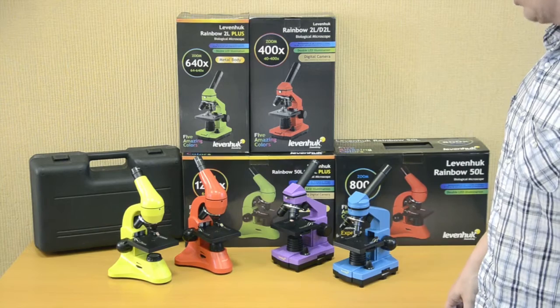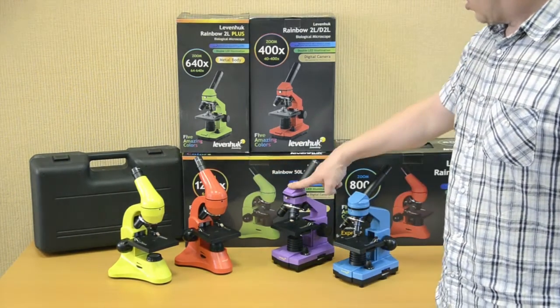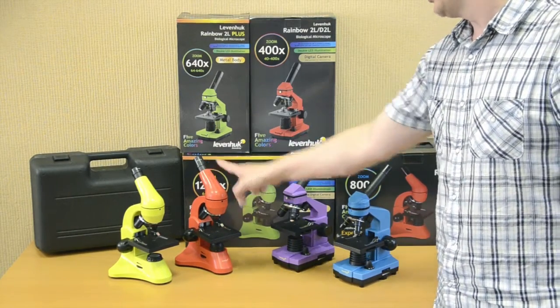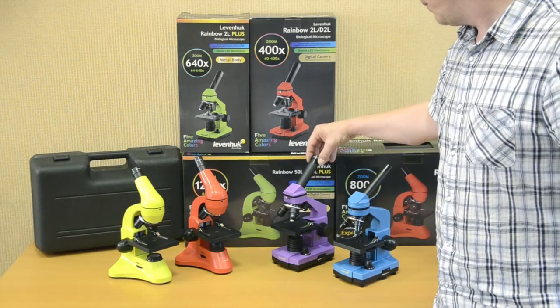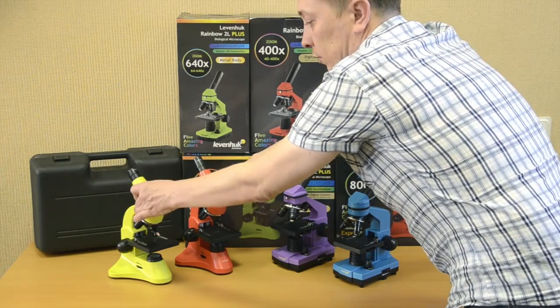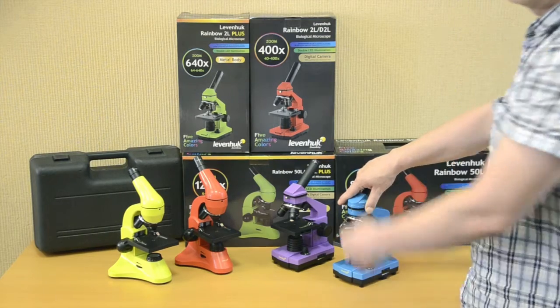Let's compare them. Generally, the design of all these microscopes is similar. The first difference is body material: Levenhuk Rainbow 2L and 50L microscopes have bodies made of plastic, while Levenhuk Rainbow 2L Plus and 50L Plus are made of metal. The Rainbow 2L and 50L microscopes come with 10X eyepieces, while the Rainbow 2L Plus and 50L Plus have 16X eyepieces. All Levenhuk Rainbow microscopes, except 2L models, feature rotatable heads. Three objective lenses of 4X, 10X, and 40X magnification power are in the kit. The only difference is that the 40X objective in the Rainbow 2L models is not spring-loaded. All models have color gift boxes.